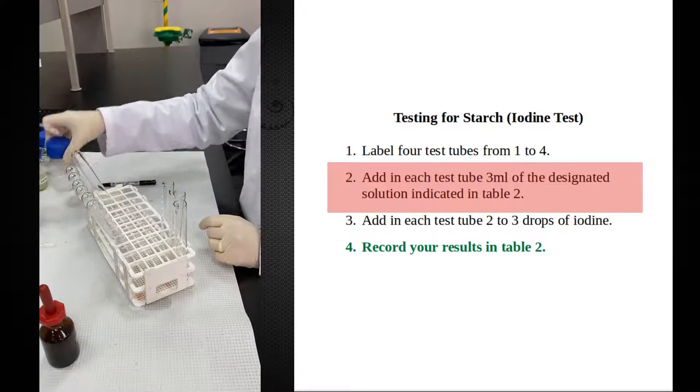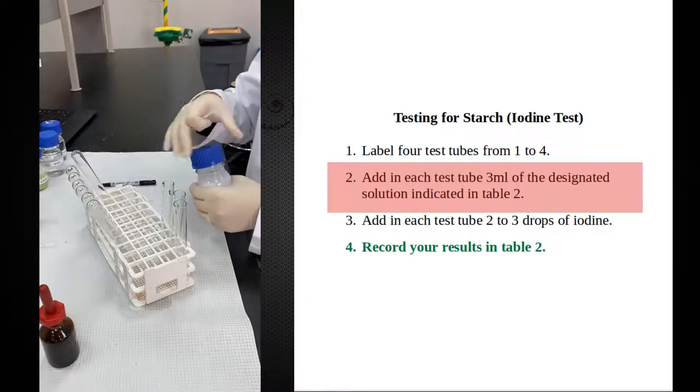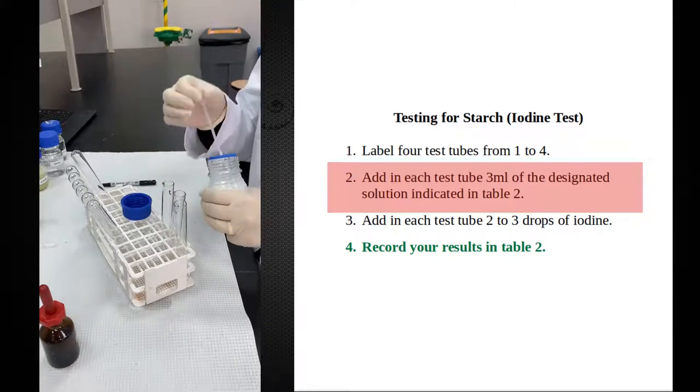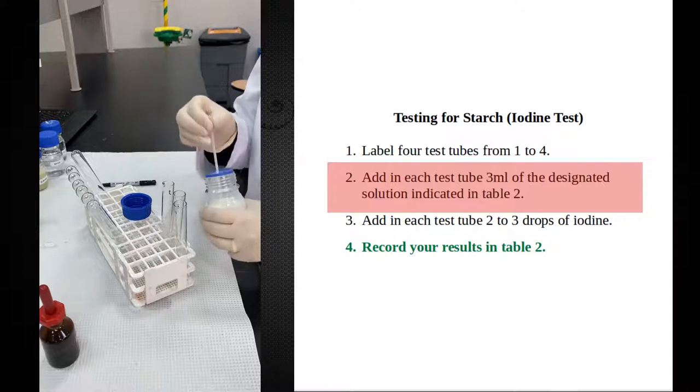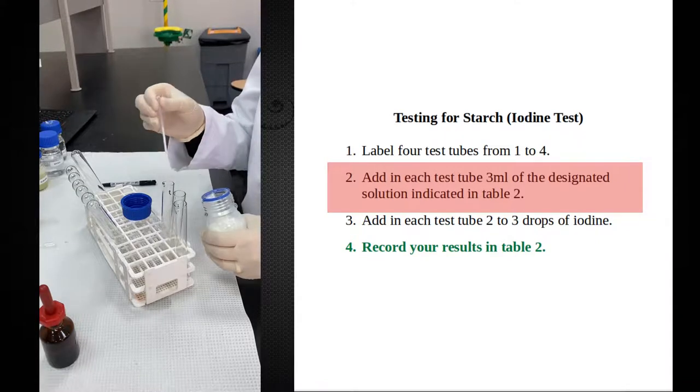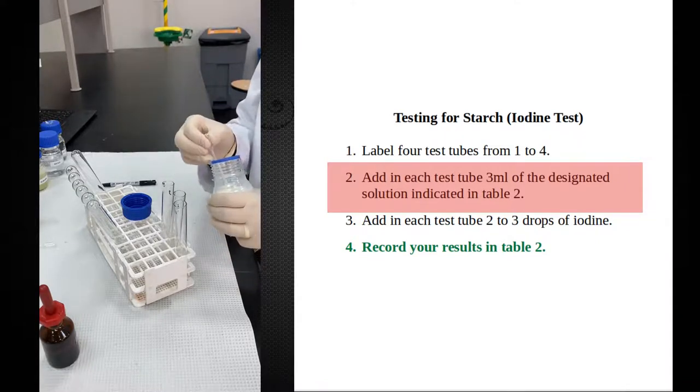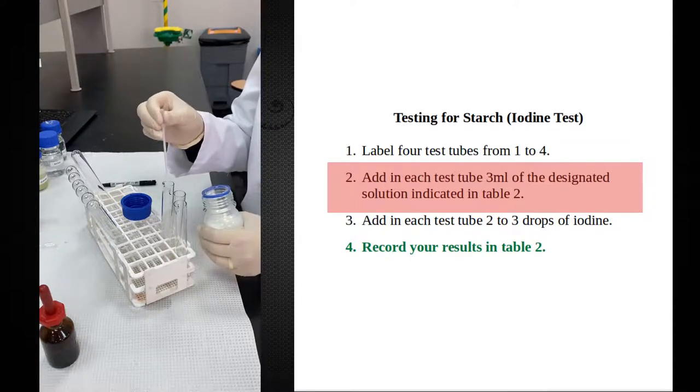I will test for you the milk to check if milk contains starch or not. So in my third test tube, I have 3 ml of milk. You can test any solution that you want using the same procedure. So 3 ml of milk.